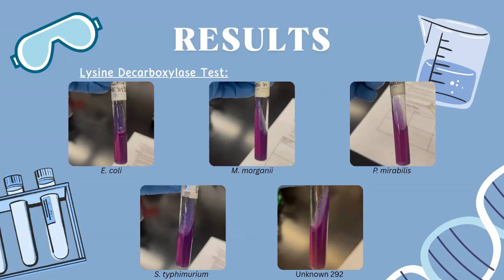The color changes that we should see are a positive result, resulting purple, indicating an alkaline pH because of the cadaverine production. Negative results are yellow, indicating acidic pH from glucose fermentation without the lysine decarboxylation. All of our results seem to be a bit skewed because none of them really change color.